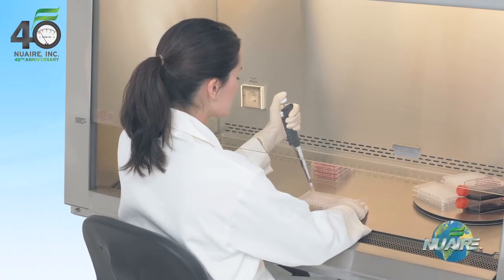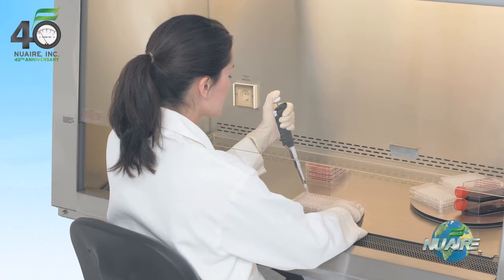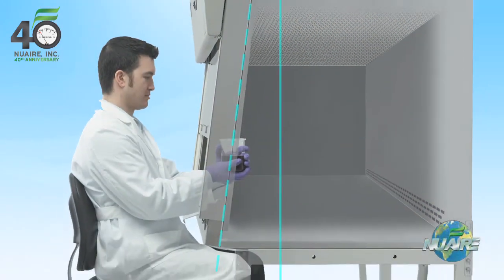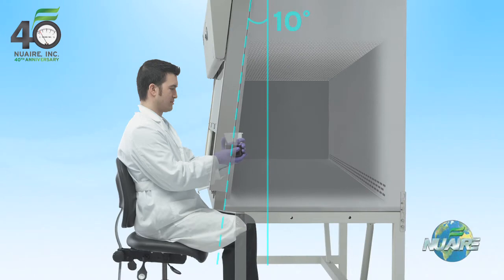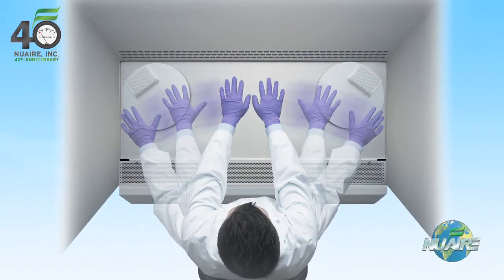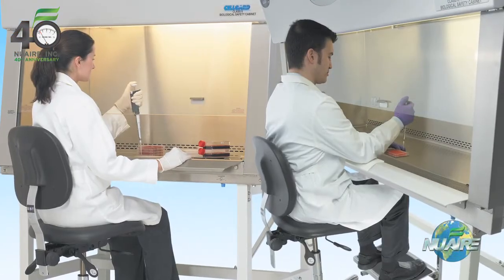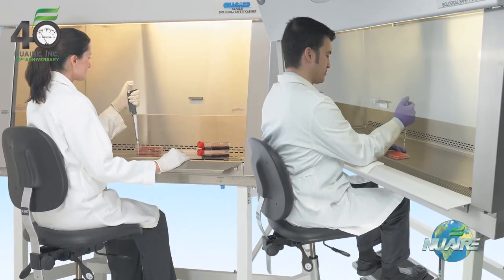Thoughtful ergonomic features enhance personal use and comfort when engaged with scientific research. A 10-degree sloped front view screen offers increased user comfort. A shorter reach into the work zone, large work area, and proper knee room reduce leg, back, arm, and neck strain.